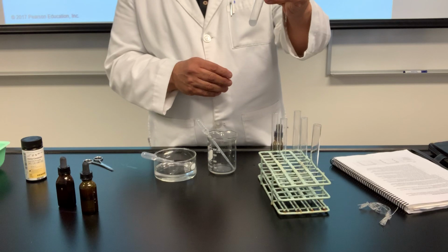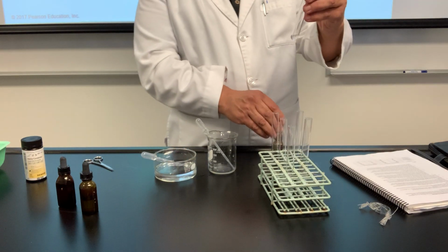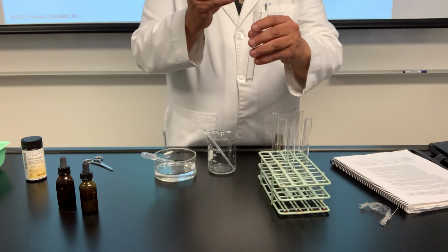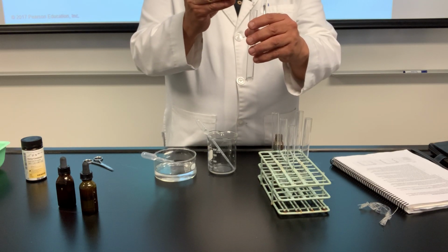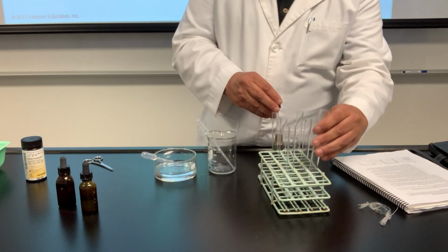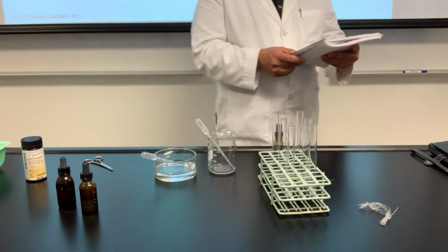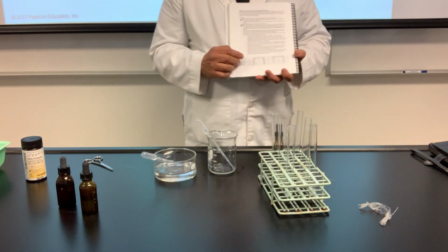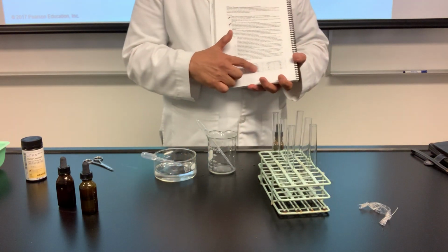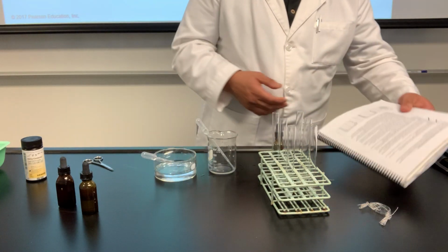It's out there. So, good. What is our prediction? Did it enter the bag? Yes. White precipitate. Green. You got it. It's in there. So for sulfate, it's also plus plus. Sulfate inside of the bag after is plus. Outside of the bag after is plus.